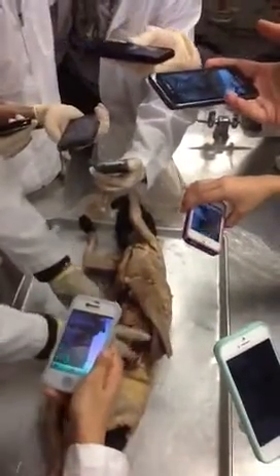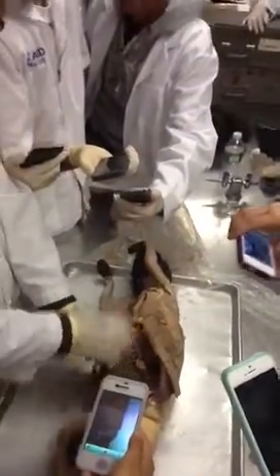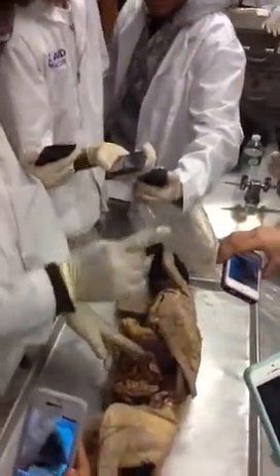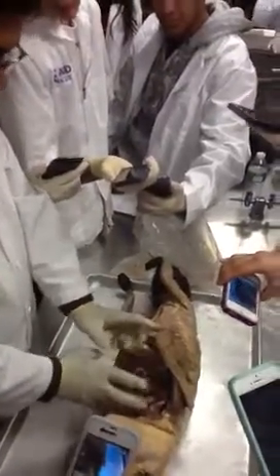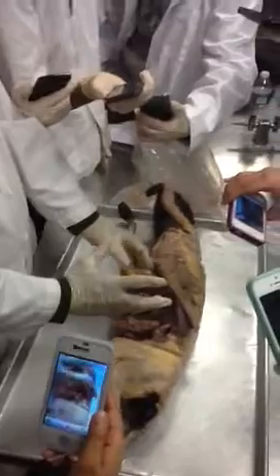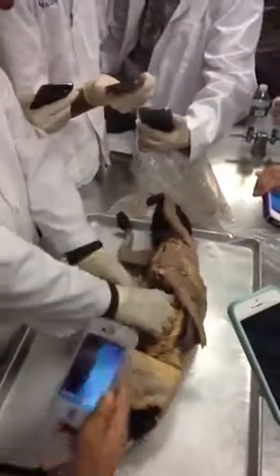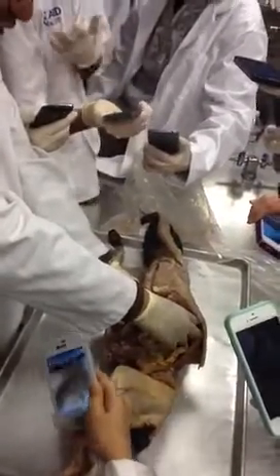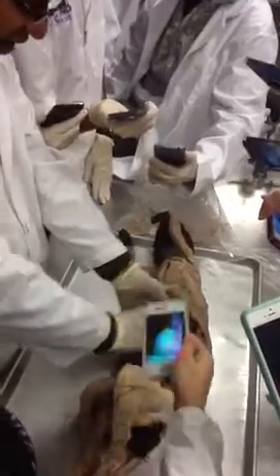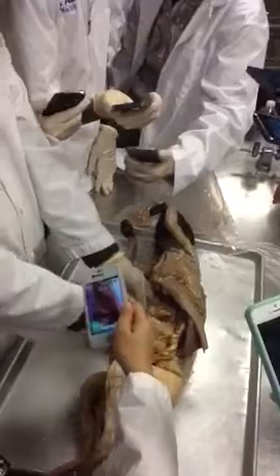Pyloric sphincter. Not sphincter, duodenum. No, first duodenum, then jejunum, then ileum. Three parts of the small intestine. Which one is what? Very difficult to say because this is like a tube. Sorry, but the initial portion you can actually say. After the stomach, the initial portion must be duodenum.